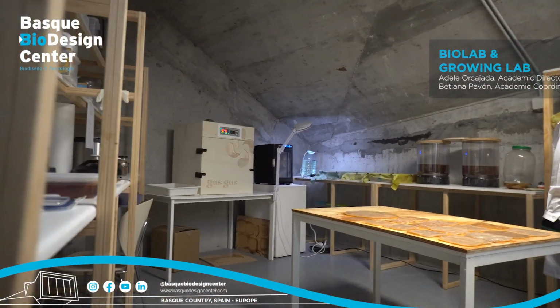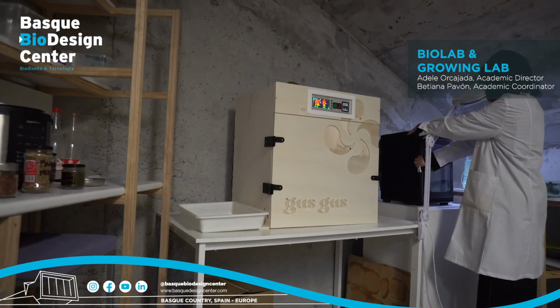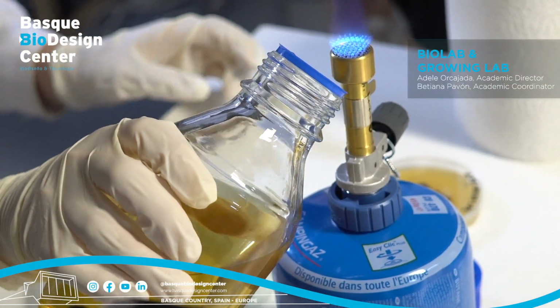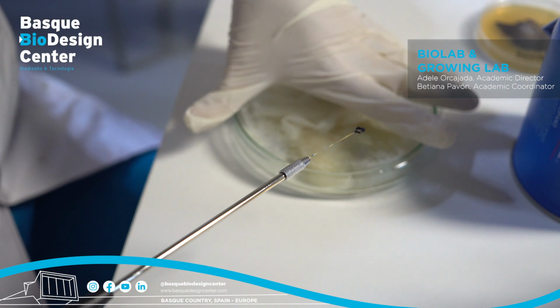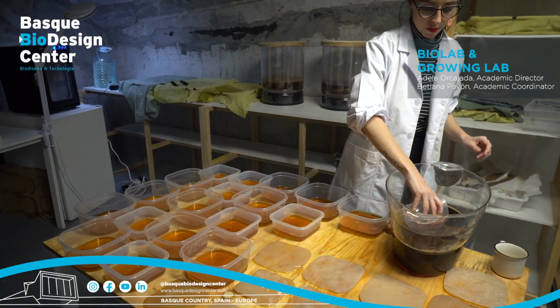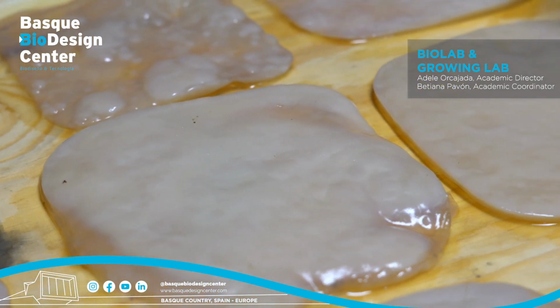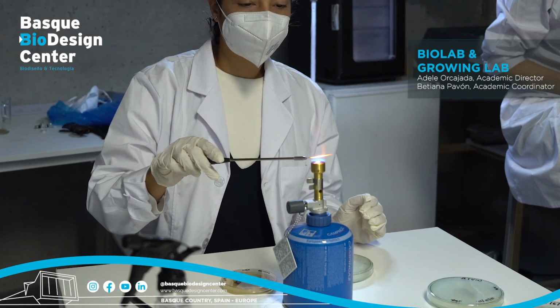And here we're going to go into our second biolab, or as we like to call it, the growing lab. This is a space where we work with all the living organisms and where we make sure that the space is sterile and clean and that we have a healthy environment for all of our exciting raw materials. We work especially with bacterial cellulose, which is the SCOBY that grows on top of the kombucha tea that we make. And we also work with mycelium and with bacteria. So you can see that we've got quite a big range of kombuchas cultivating in different shapes and forms. And we've got our incubator with our bacterial dyes. And then we have some DIY equipment to sterilize, to clean, and to keep things in the right place. And like I said, a healthy environment.